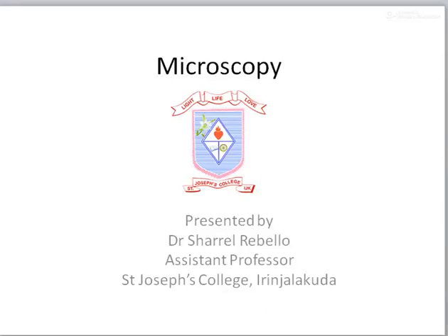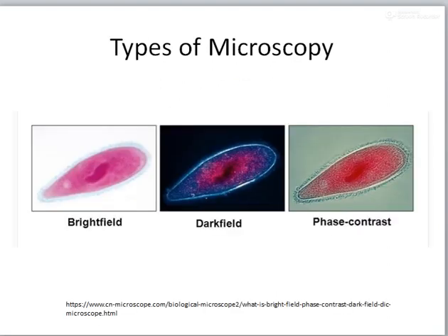Welcome back, dear students. Let's continue with microscopy, especially the types of microscopy. We had previously mentioned the bright field as well as the dark field microscopy, and now we are going to deal with phase contrast microscopy.